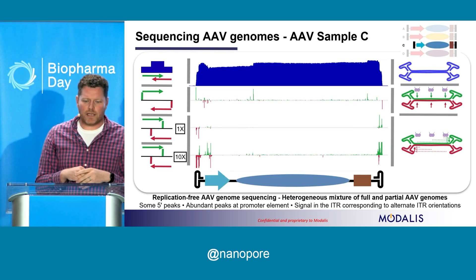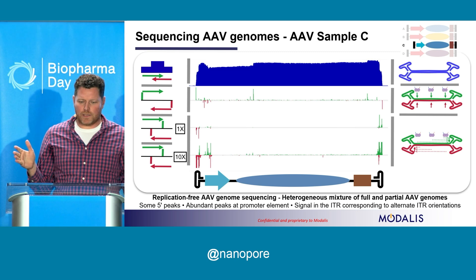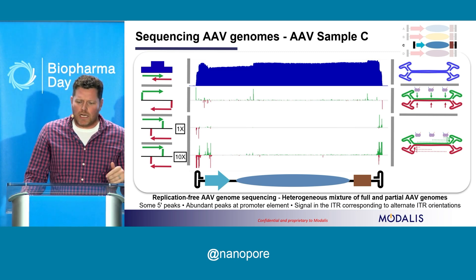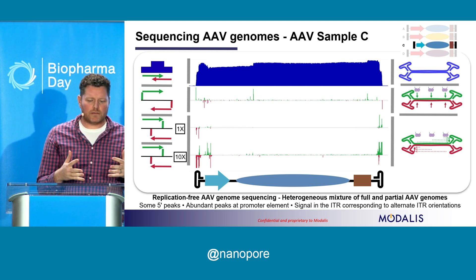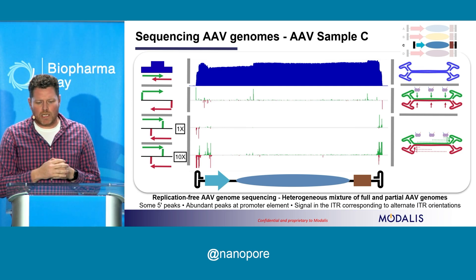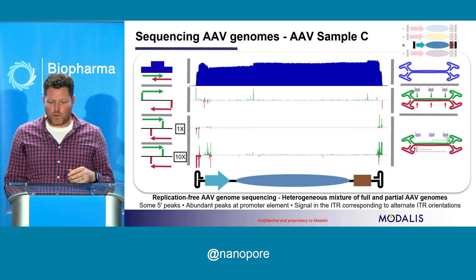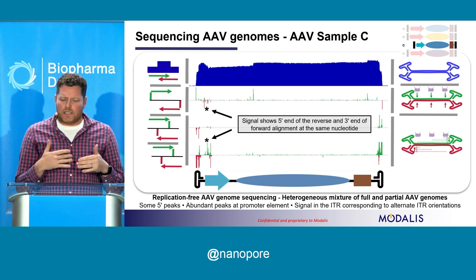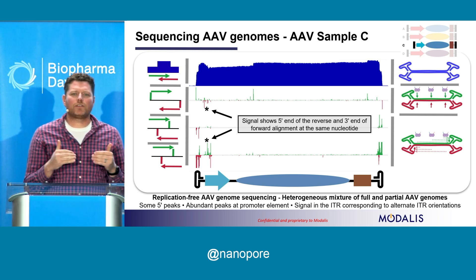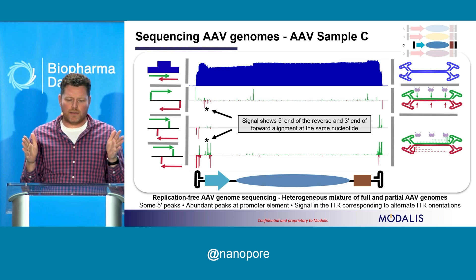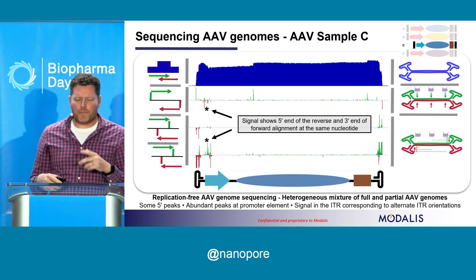Then we took our mixed population and did the same analysis. We got pretty good coverage throughout the length of the genome, but this time at the five-prime end we got a little peak, and at the three-prime end a little bump as well. When we looked at the five-prime ends of the alignments, we see more signal within the promoter region and a couple spots along the way. At the three-prime end, we now see a pretty significant signal in that promoter region when we increase by about tenfold. We wanted to better understand why we were seeing this, and one thing that jumped out was that some signals showed a five-prime end on the reverse strand at the exact same position as the three-prime end of the forward strand.